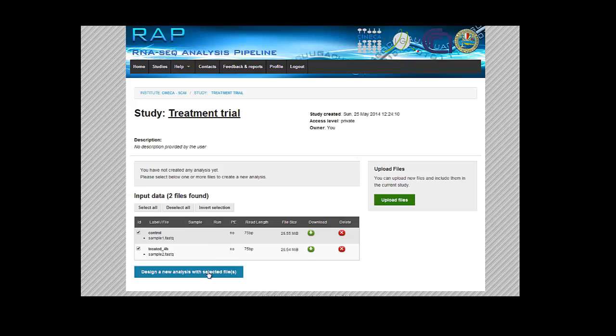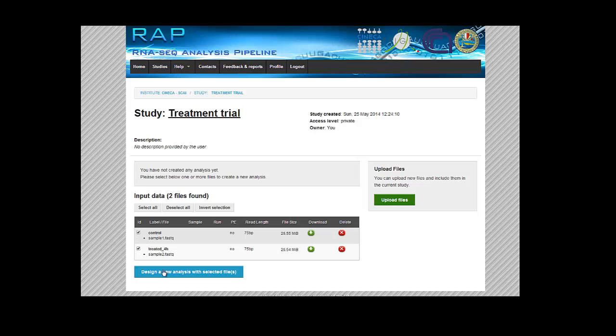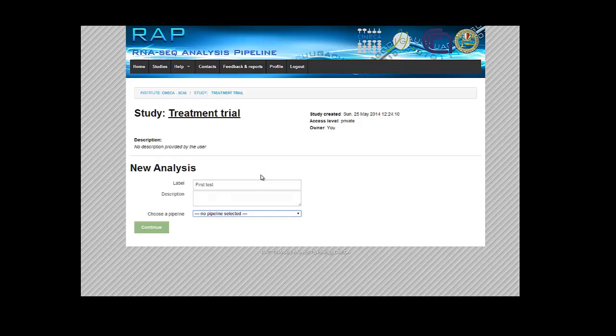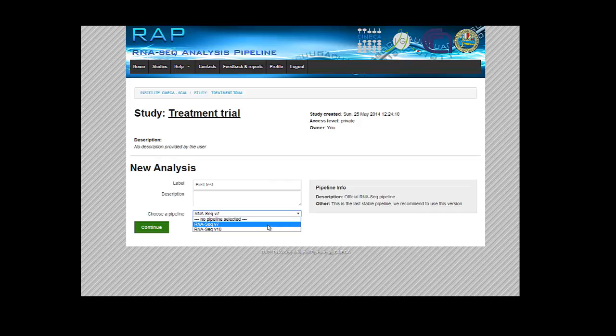So here we have two files and we can start an analysis. We just select them—they're already selected. We click on this Design New Analysis with Selected Files button. We'll give it a name, our first test, and we choose the standard RNA-seq pipeline.